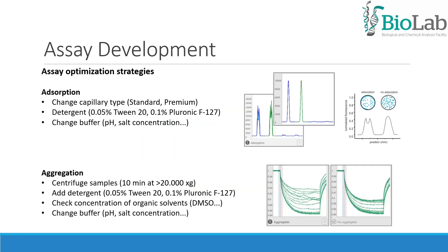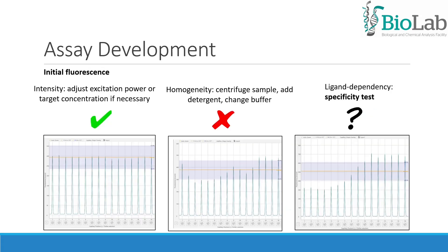When adsorption occurs, you can change the capillary type, add detergent, or sometimes change your buffer. To avoid aggregation, centrifugation, addition of detergent, or changing buffer composition are strategies that can be used. The initial fluorescence of the capillaries should be homogeneous and should not vary above 20%. Inaccurate pipetting is sometimes the cause of fluorescence variation, but centrifugation or addition of detergent may also help.